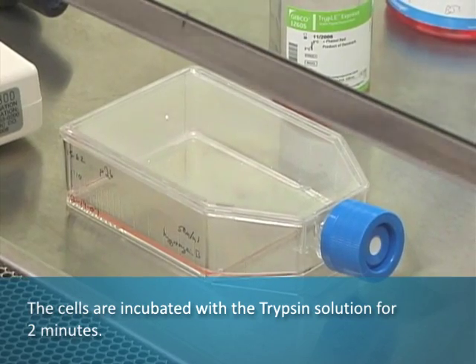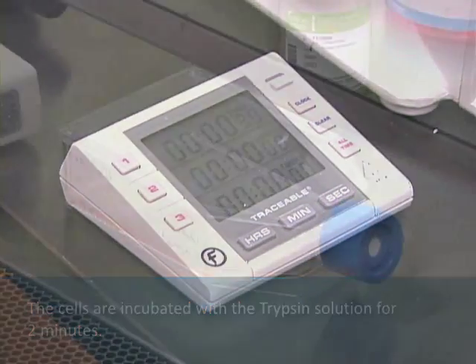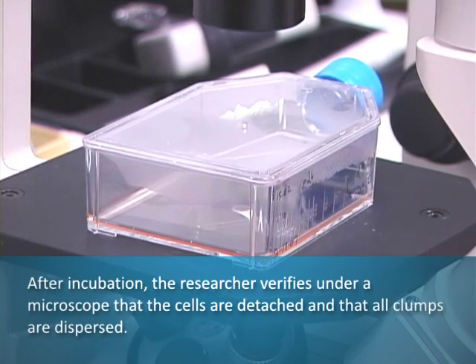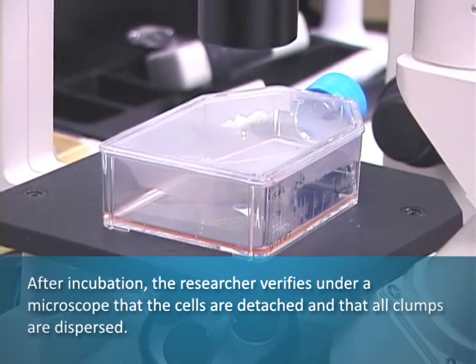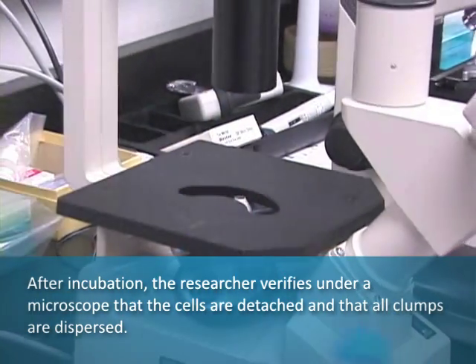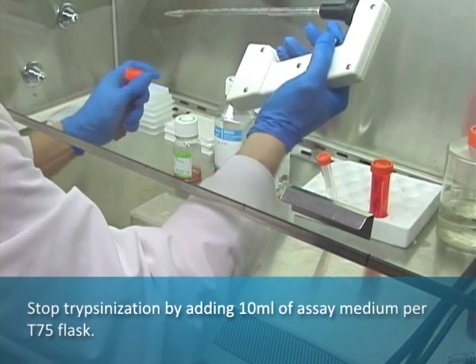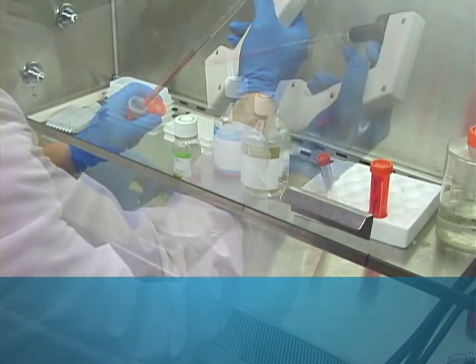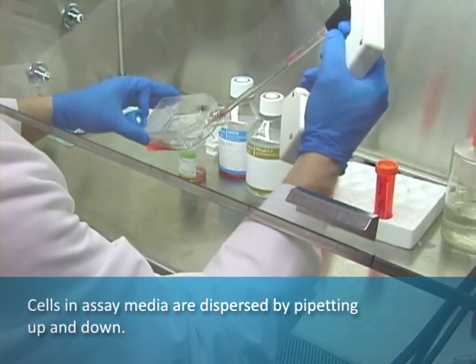The cells are incubated with the trypsin solution for two minutes. After incubation, the researcher verifies under a microscope that the cells are detached and that all clumps are dispersed. Trypsinization is stopped by adding 10 milliliters of assay medium per T75 flask. Cells in assay medium are dispersed by pipetting up and down.